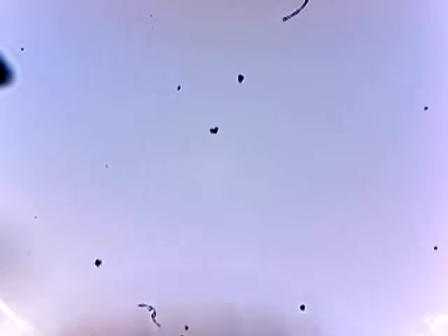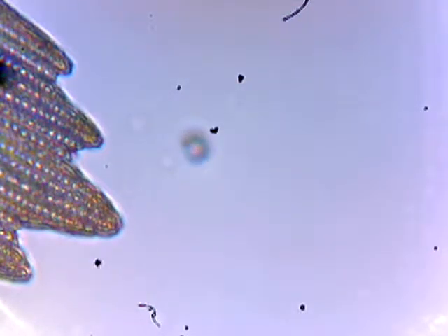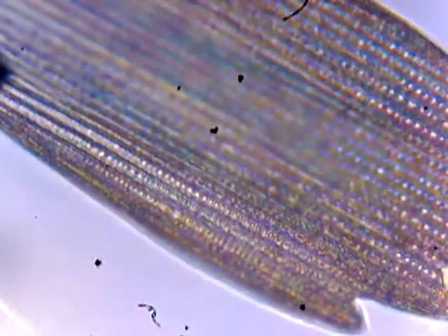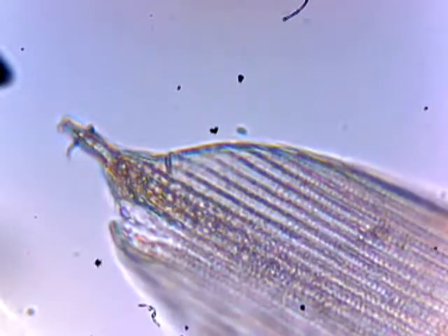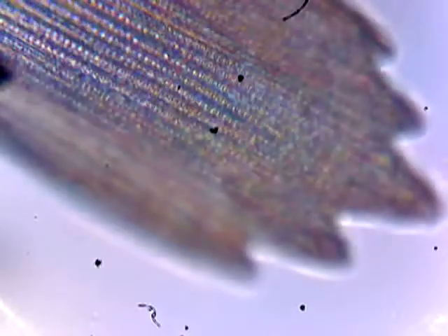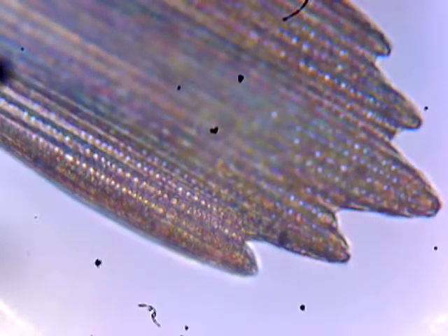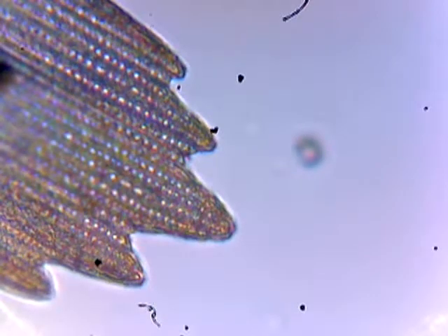So there you go. I think I'll cut it off here because it's just more of the same at that point. There's a smaller scale — they have all shapes and sizes. They have many variations in design, and that actually depends where they're located on the wing and what unique attribute they can contribute to the integrity of the wing over time and in differing weather conditions. You can see how those lobes — they're not tears. They're very sculpted structures, meant to be there to serve a purpose.